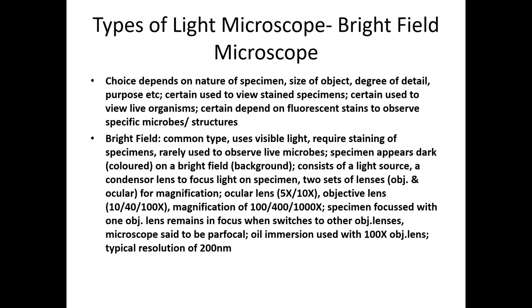Now, two sets of lenses. What are they? Already we discussed all these things. Objective lens, which is near the stage or near the slide or near the specimen. Then, ocular lens or eyepiece lens, through which we observe the microorganism. So, two sets of lenses are there.